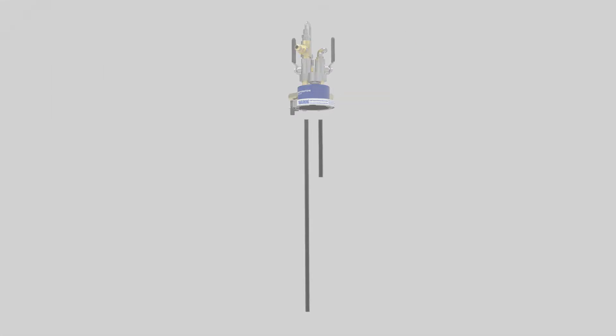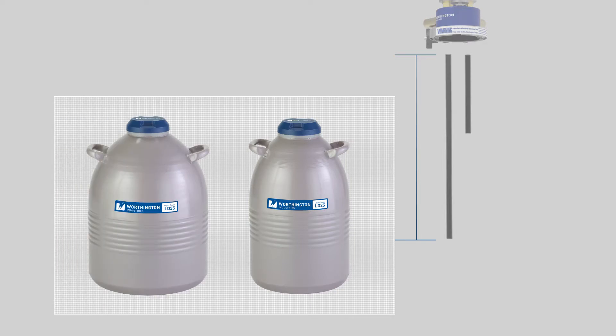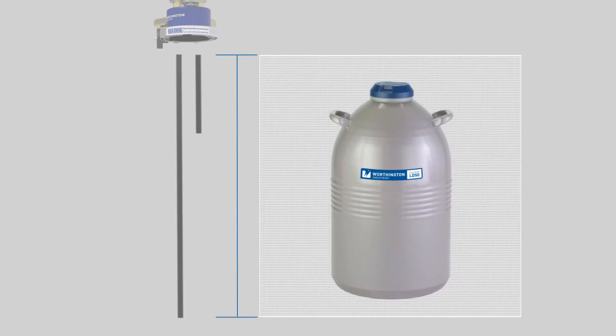The liquid withdrawal tube, which is the longer of the two plastic tubes, is scored approximately 6 inches or 152 millimeters from the end. This tube must be shortened for use with a 25 LD or 35 LD Dewar by breaking off the 6 inch section and discarding it. For the 50 LD Dewar, the tube is used as supplied.